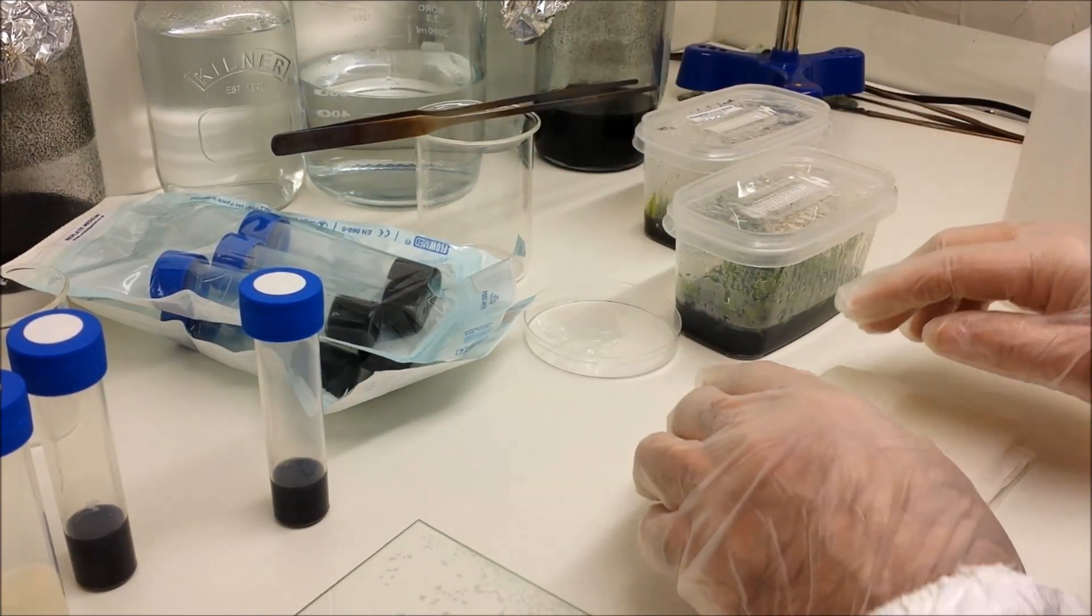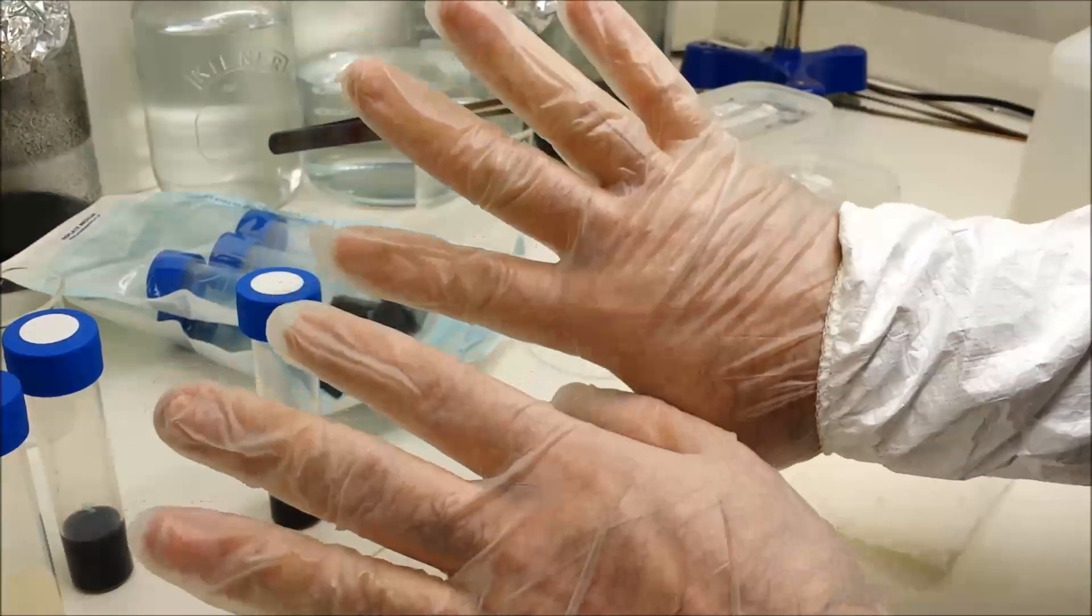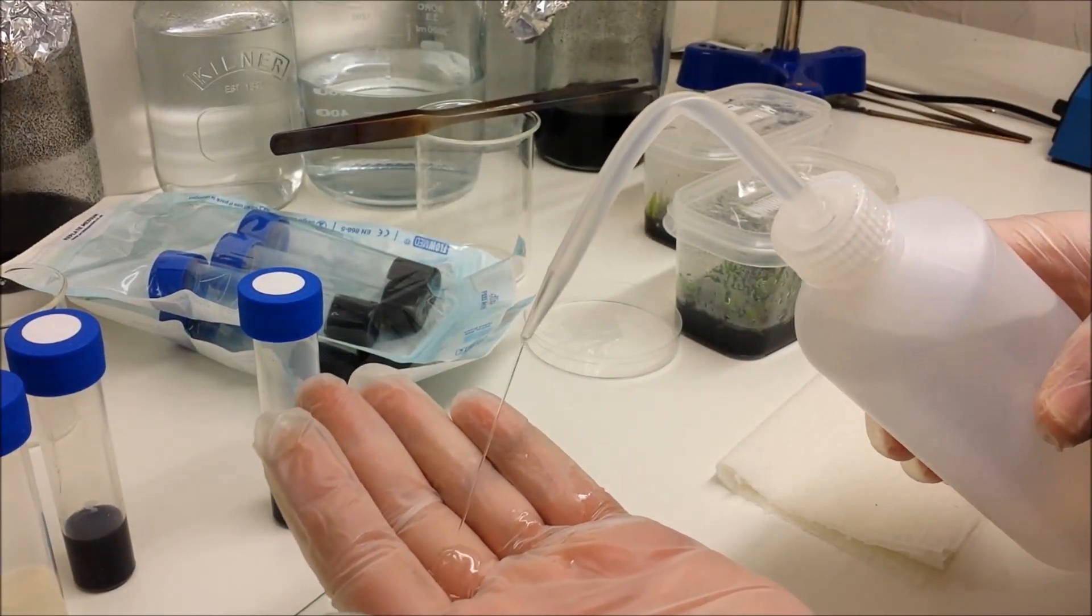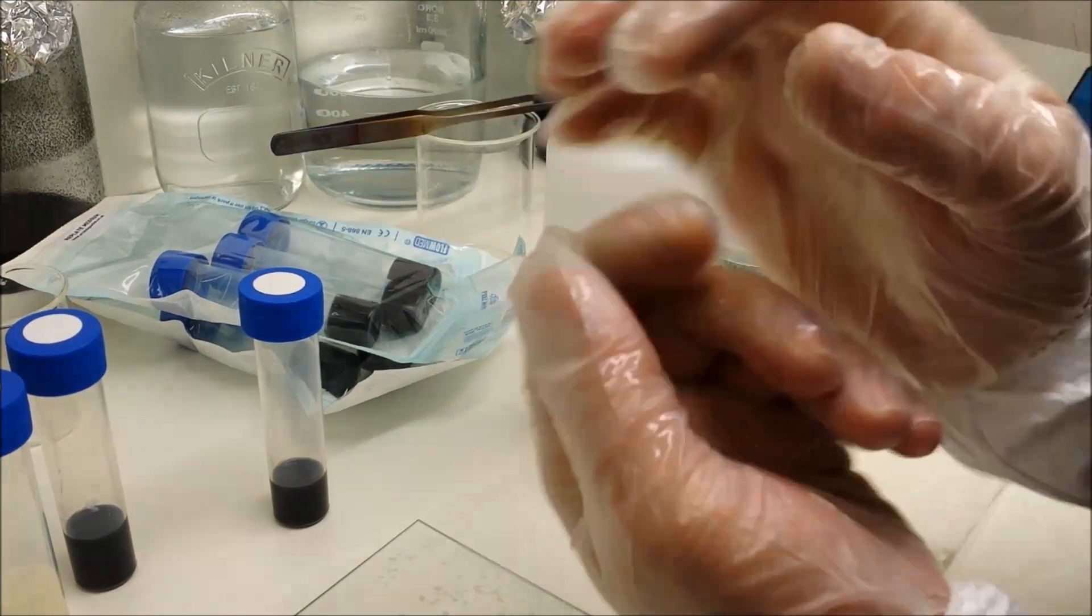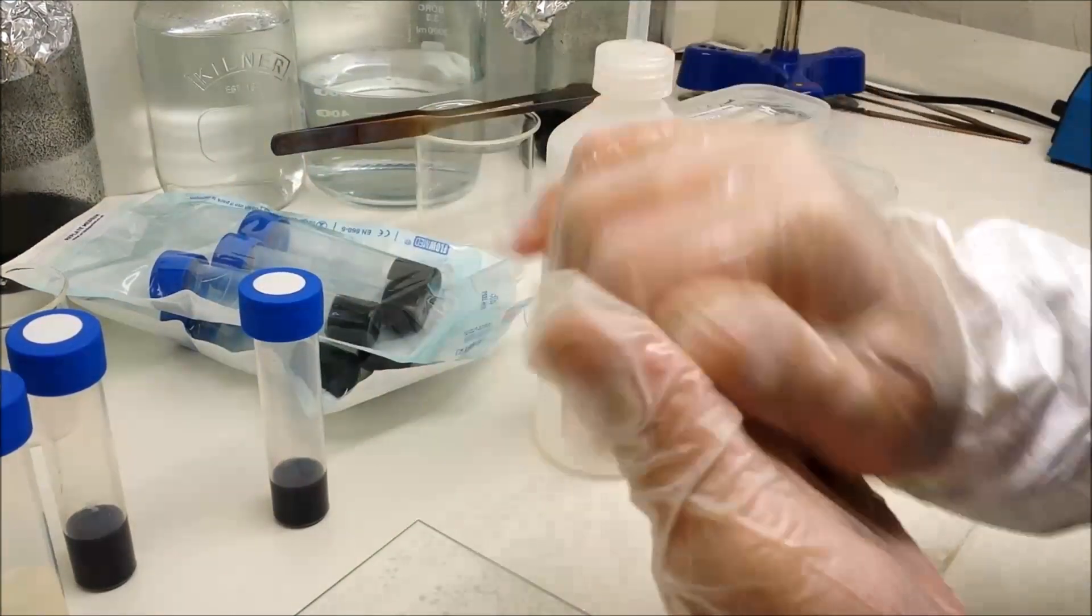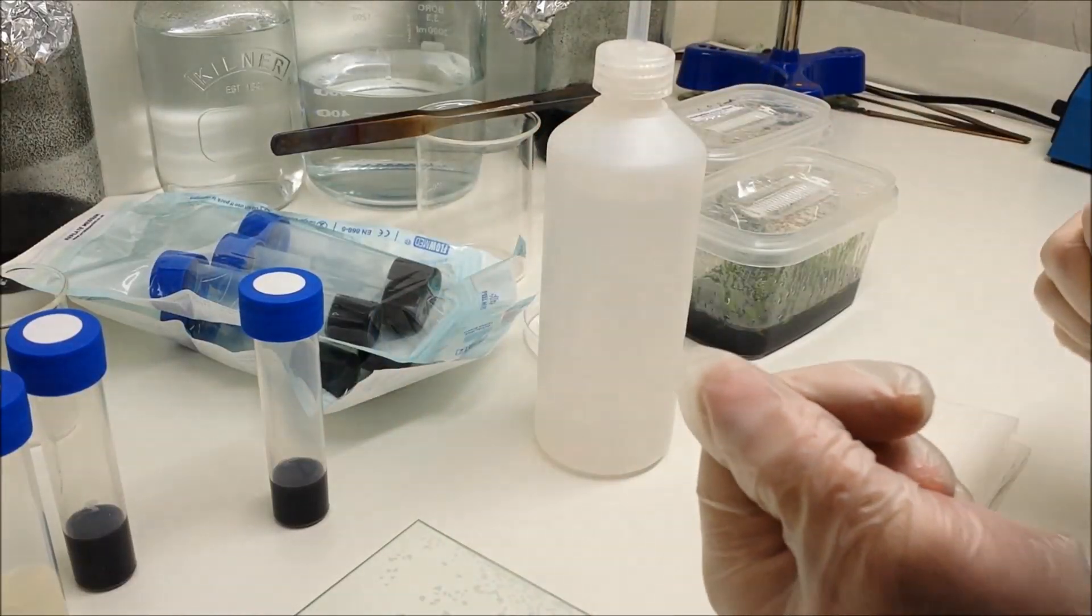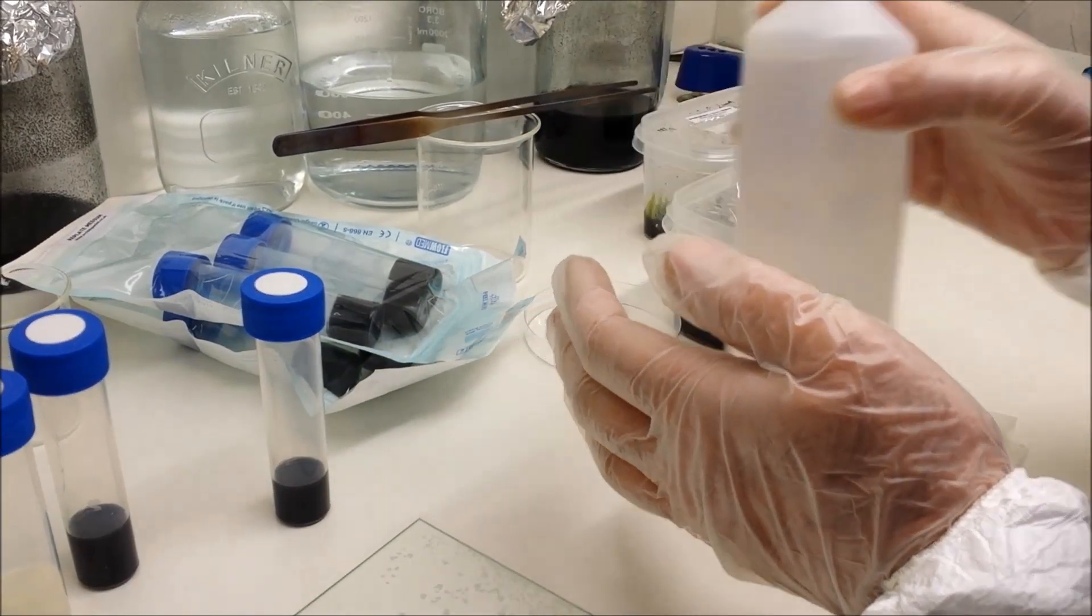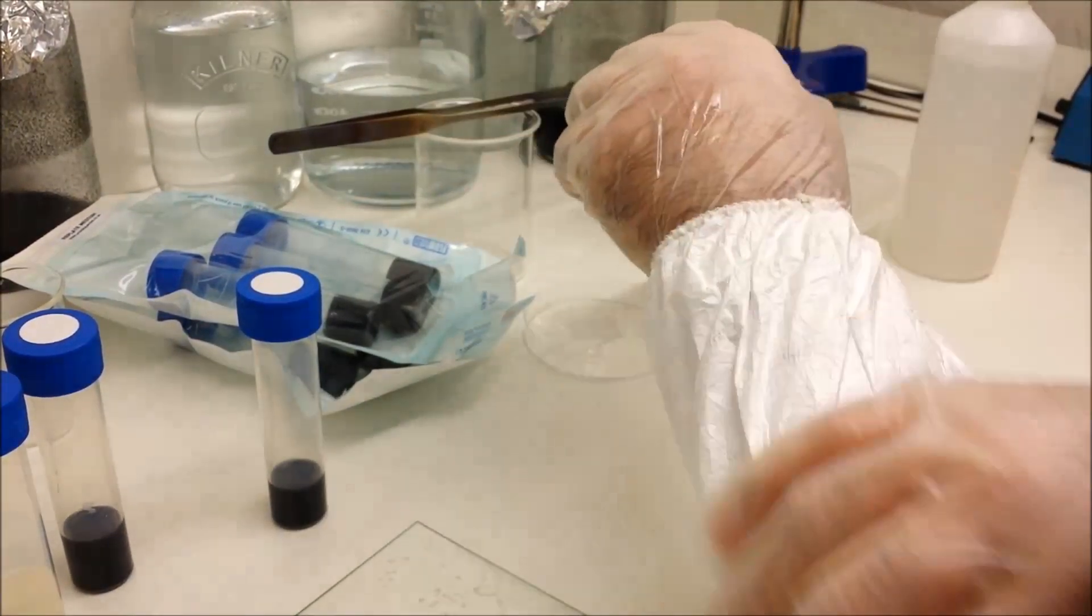Now the first thing to note is that I've sterilized the entire surface that you can see in the background, as well as my gloves, surgical gloves. I'm applying IPA, which is isopropyl alcohol, giving it a good rub to sterilize my hands. It's the most important thing that you can learn from this video—any germs whatsoever will contaminate your agar.